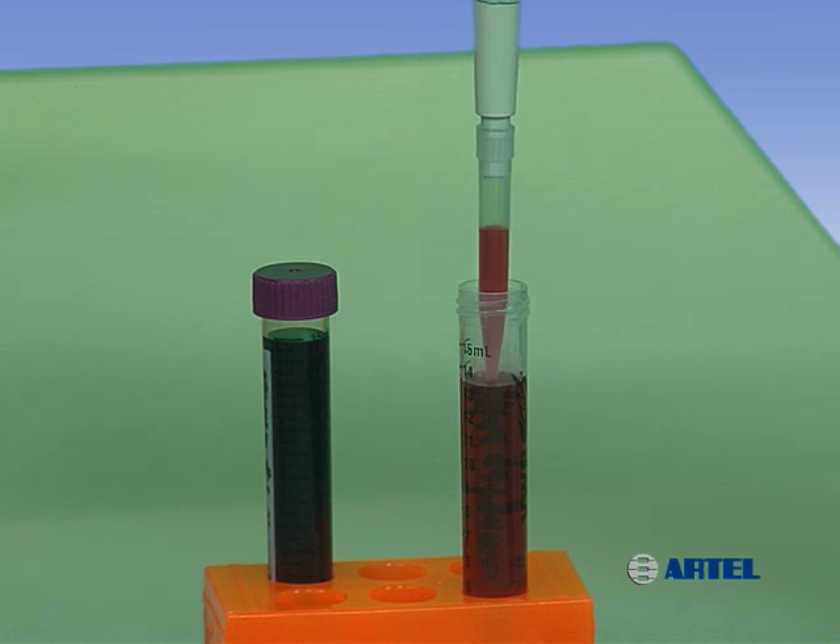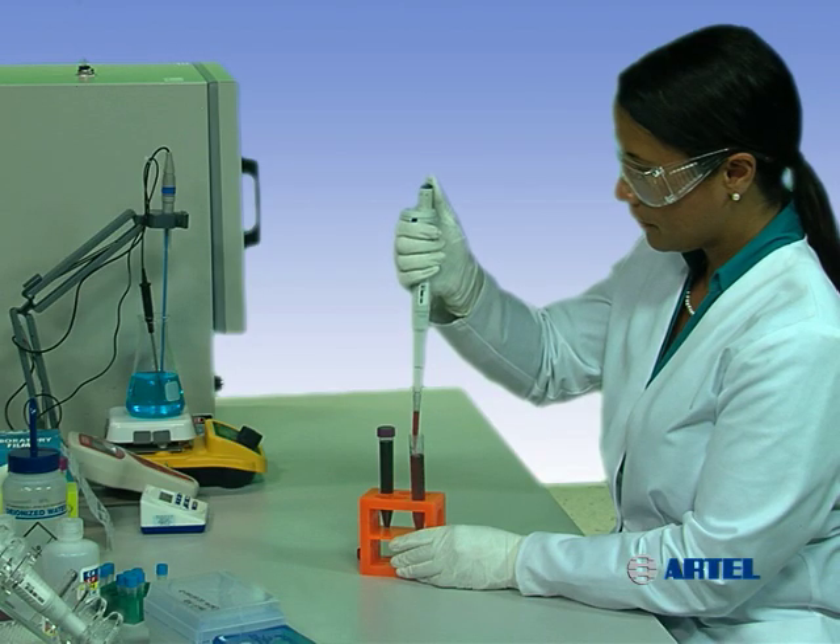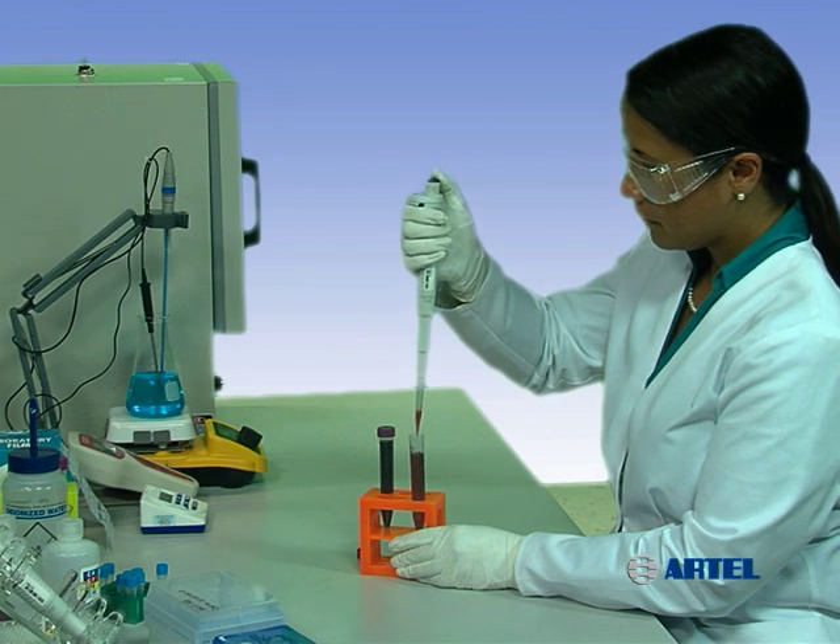After releasing the plunger with the tip still in the sample, it can be good practice to pause one to two seconds, which will give the liquid and the pressure inside the tip time to stabilize. A pause step such as this can be especially important when working with viscous solutions.